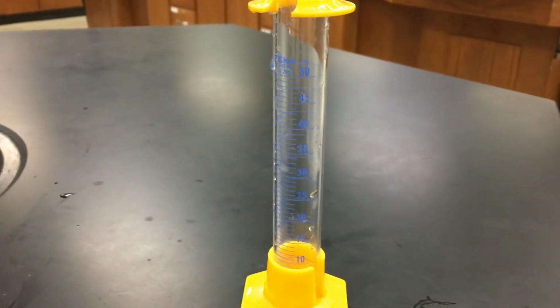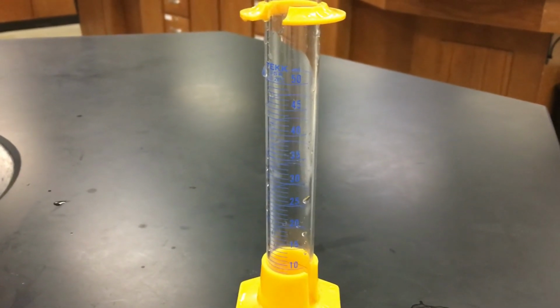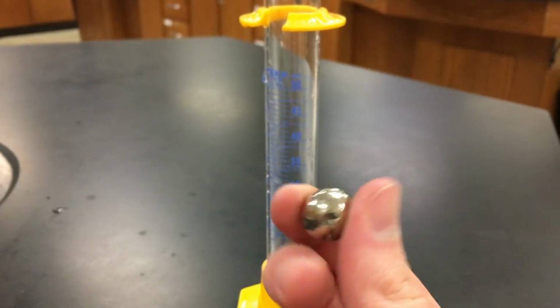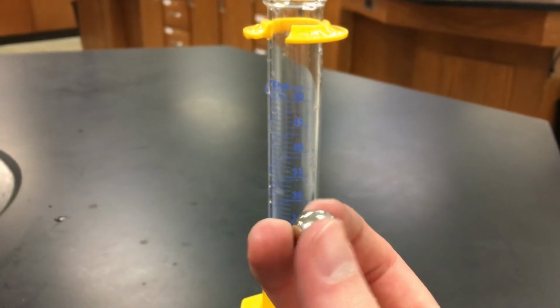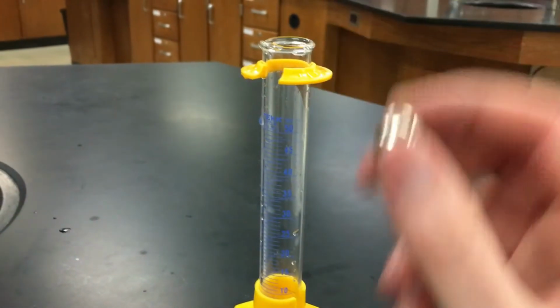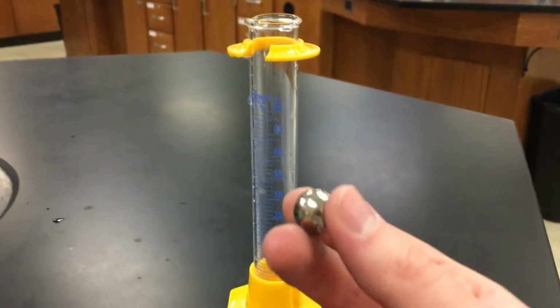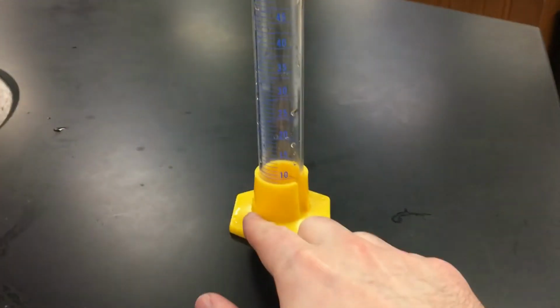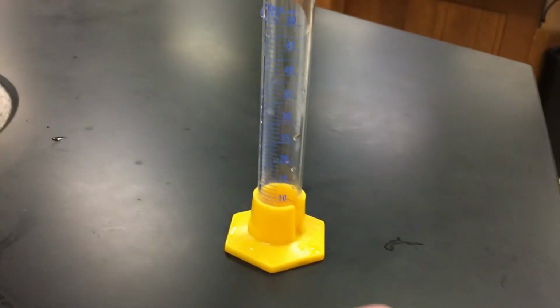Okay, so I'm just going to use water because it's available and cheap as my liquid, and it's not going to do anything to the nickel marble here. It's not going to react with it or anything like that. I just have to be careful as I put the nickel marble in. Since this is metal and this is glass, I don't just want to dunk it, or else I'm going to bust the bottom out of this thing, which has happened before. So you just have to be careful. So we're going to tilt it and slide it.